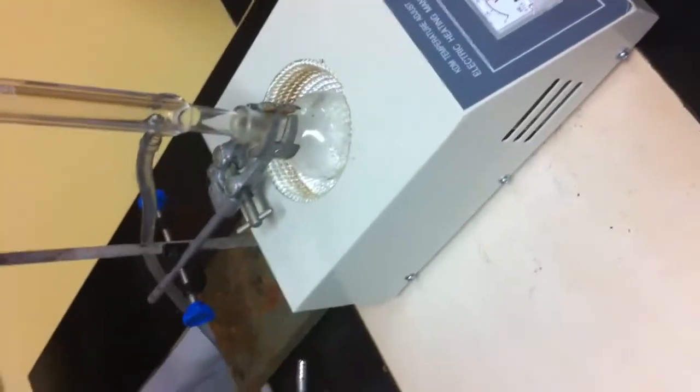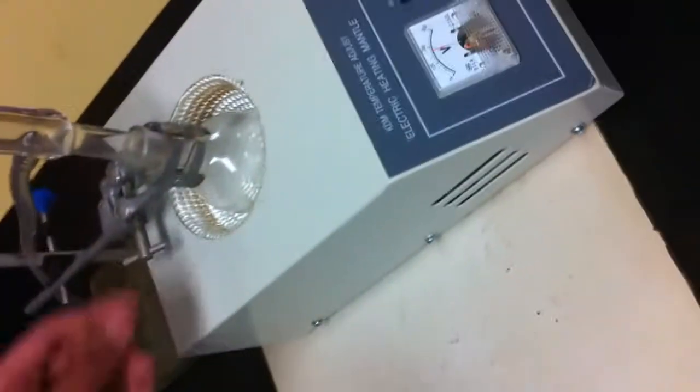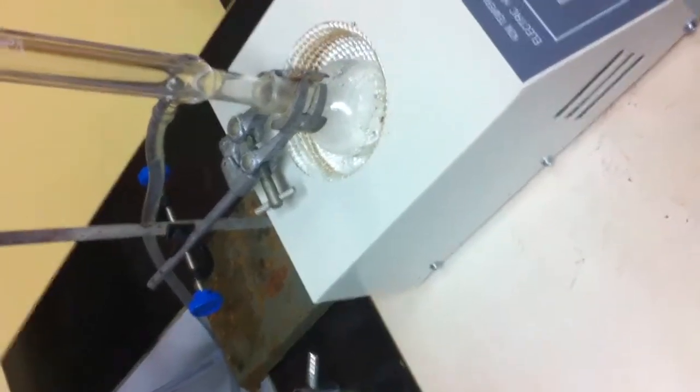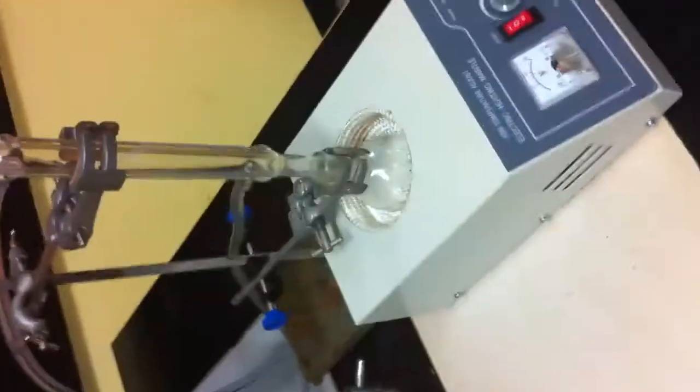We got everything in there, right? Yeah. We got the acid, the alcohol, the sulfuric acid, and the boiling chips. That's all we need to put in. Yep. Okay. Should we? Did you mix it around? Do we need to? It might not be miscible. Wait, it should be miscible. No, it will mix anyway, because it'll heat up, and then it'll collide and everything. So that's all. We'll be back.